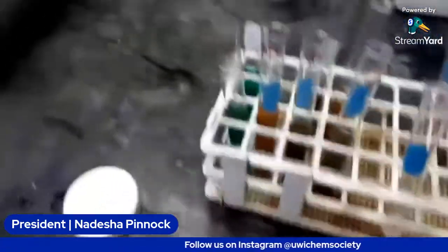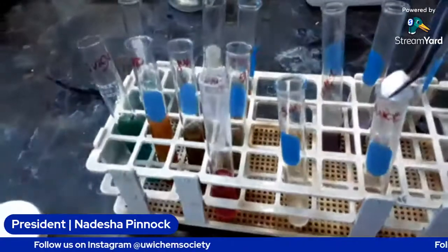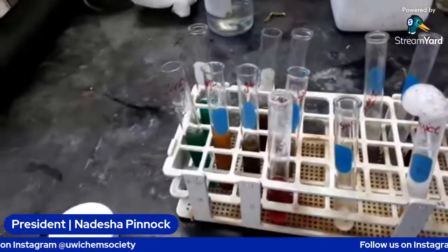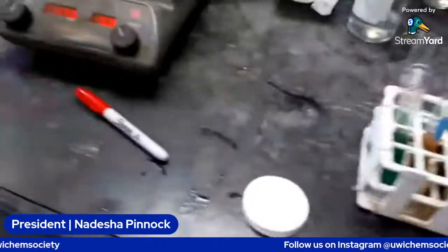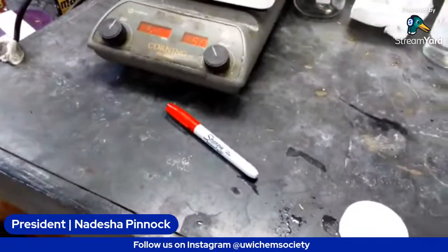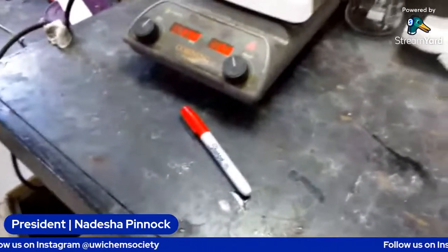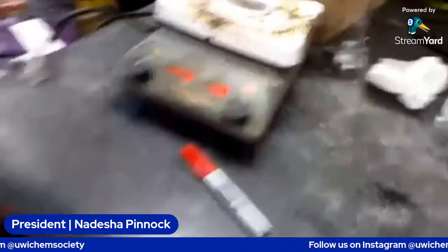I'm going to add some to the fruit juice. There you go. Benedict's solution. You put the malt in?